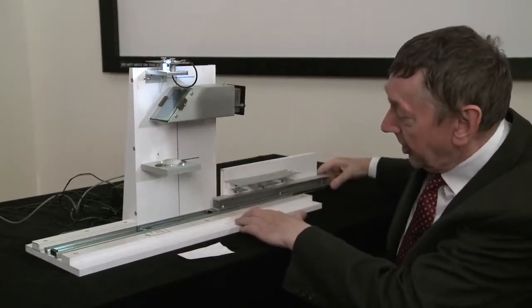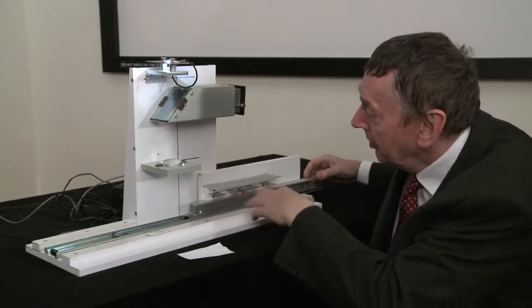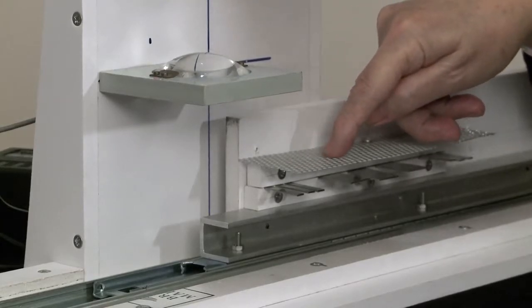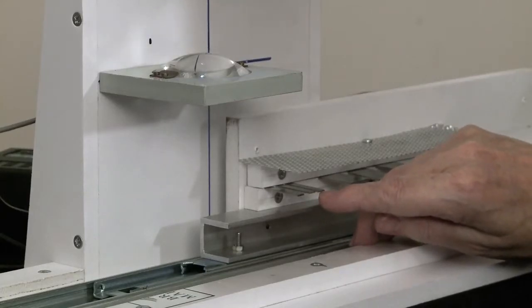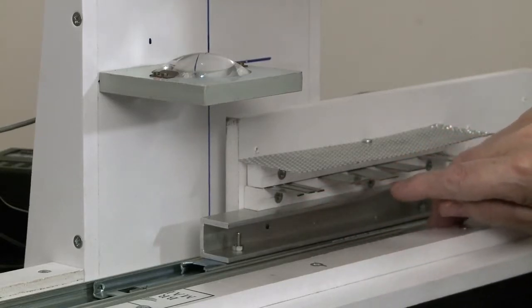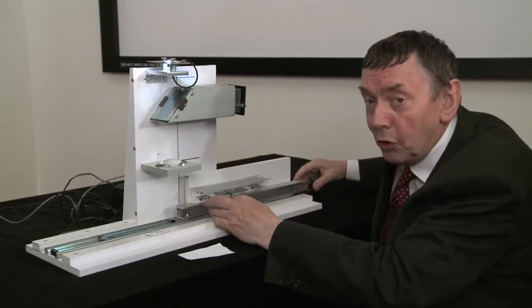Now, over here, mounted in this sliding arrangement, I have a specimen which models a biological specimen much more realistically because it has depth. At the top level, we have a shiny metal grill with many holes in it. At the second level, which corresponds to the level of the focus, we have metal plates in three groups. In the first group, narrow ones, and second group, broad and then narrow. And if we could pick up the signal from this layer, we would get the Morse SOS signal.